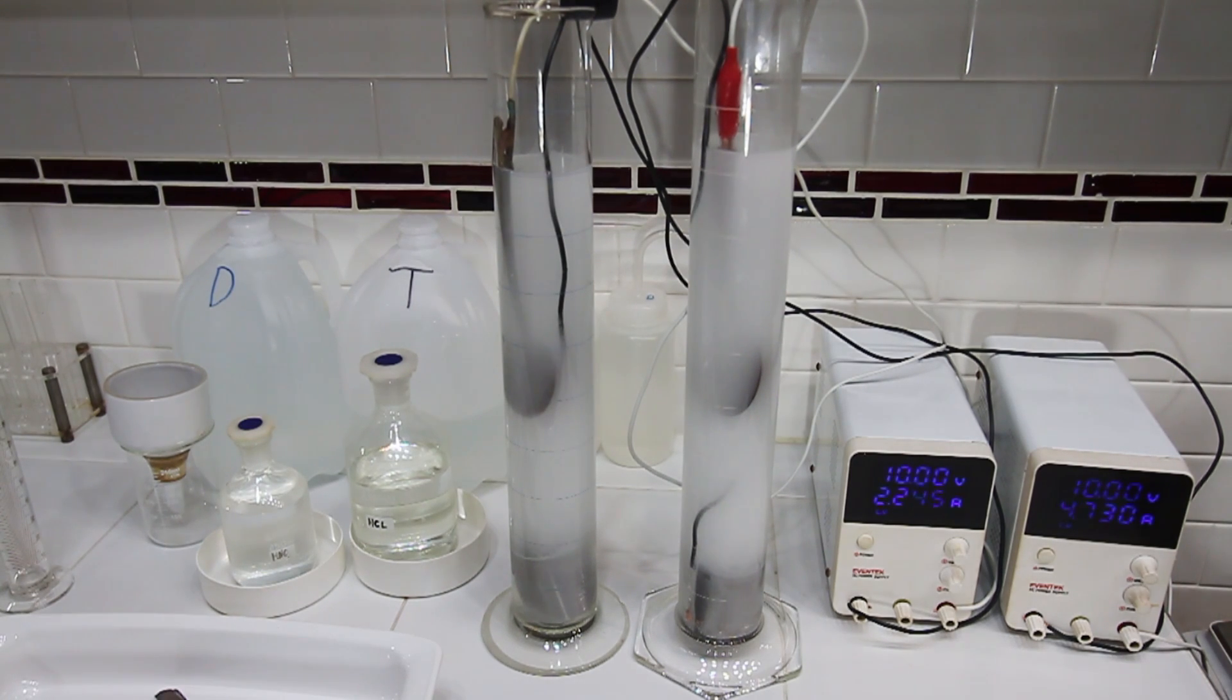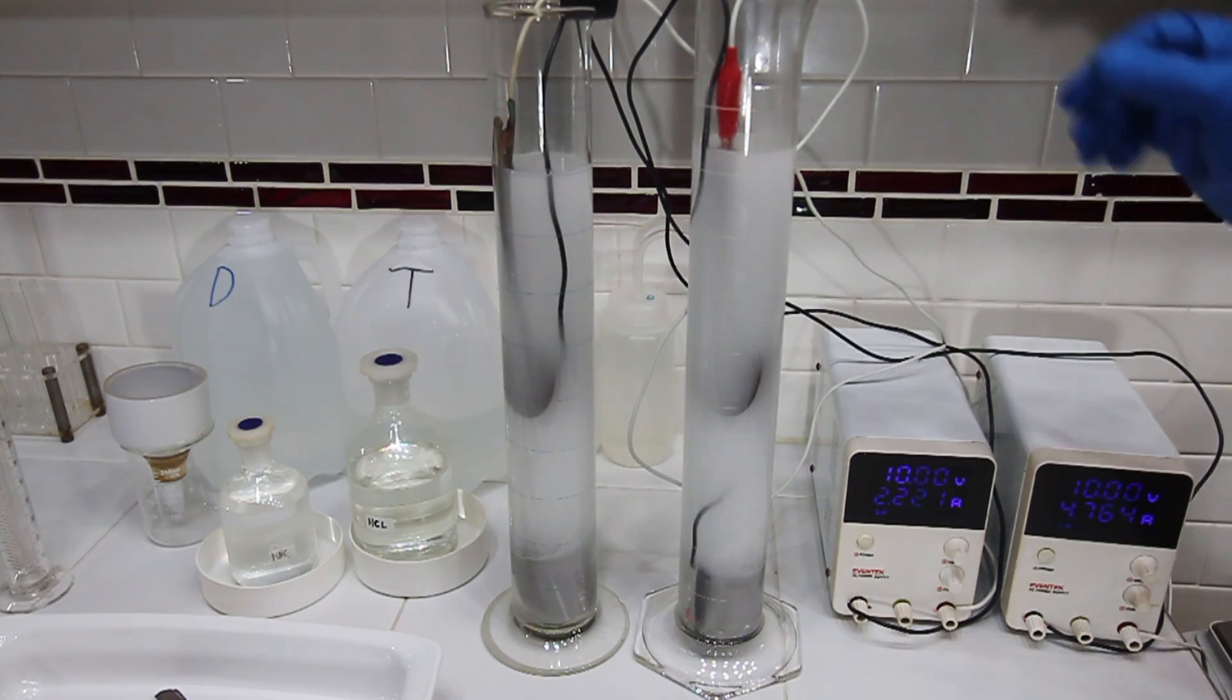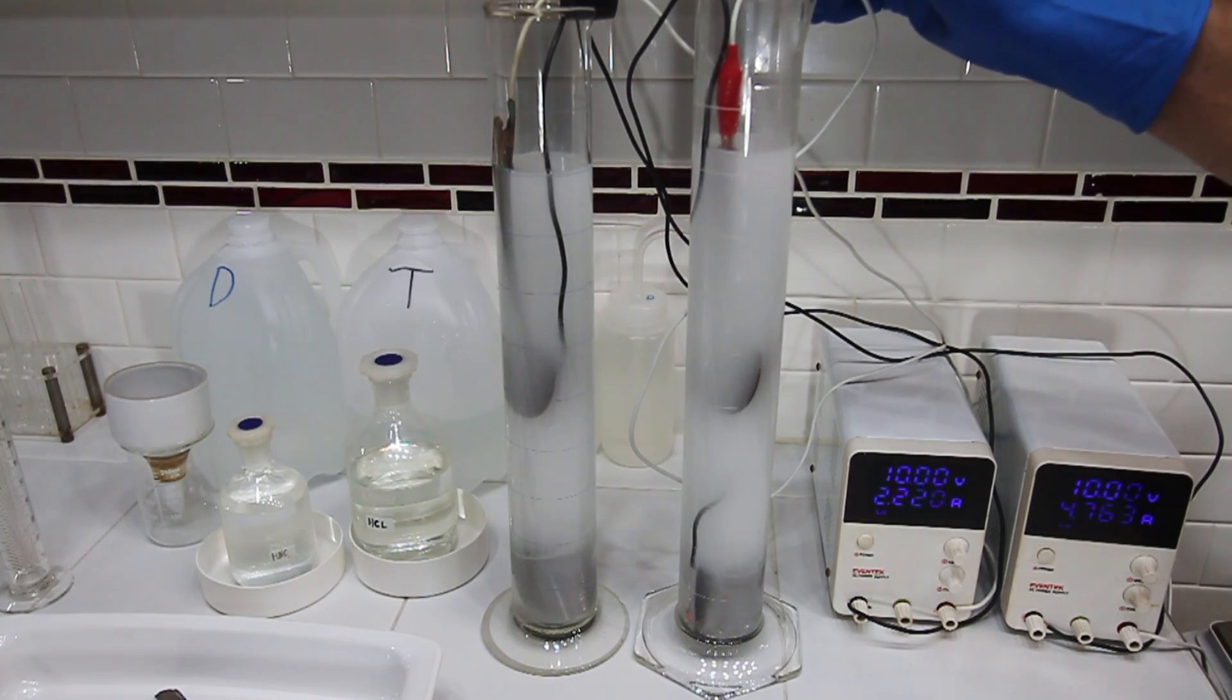First thing I'm noticing here is I'm getting twice the amps. So this reaction—this electrolyte is definitely producing a larger current, so this should work faster. I'm going to set a timer and we're going to let this run for 10 minutes.